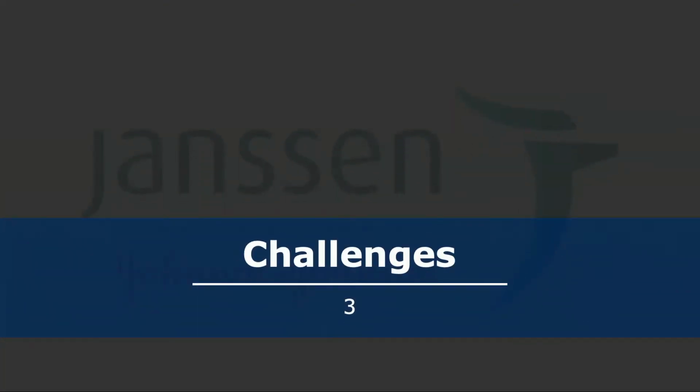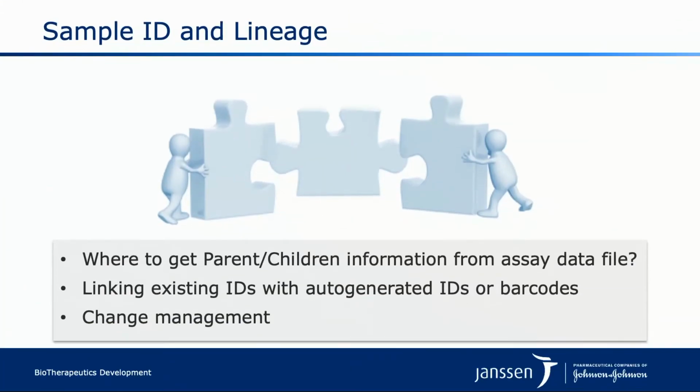So that's the stage we're currently in, and for the last part of my talk, I want to talk about a few challenges we're facing while implementing this system into our daily operation. The first question is the sample ID and the lineage. How do we track this lineage?